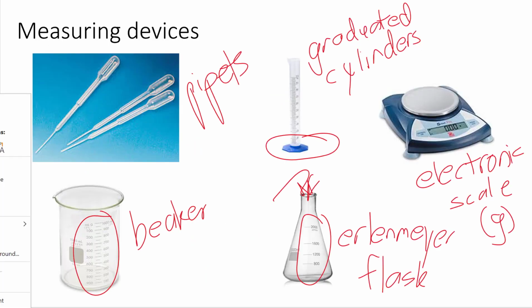When you're using an electronic scale, the values on here actually tell you how many significant figures there are. So on your electronic scale, if you got 3.42 grams, you will notice that when you're weighing, this number is the last one to stop moving. So that's actually the uncertain digit. And the 3 and the 4 are the certain digits. So in this case, it would be 3 significant figures for the electronic scale measurement shown here.